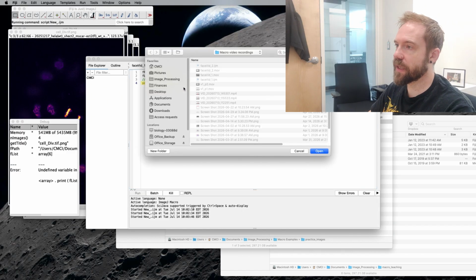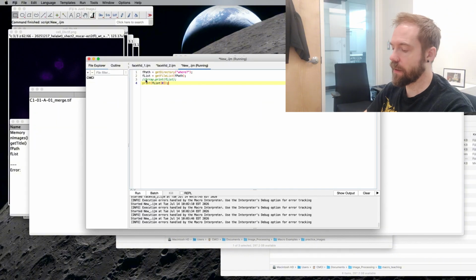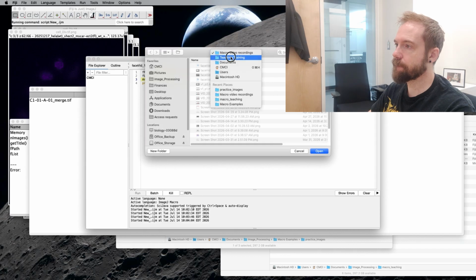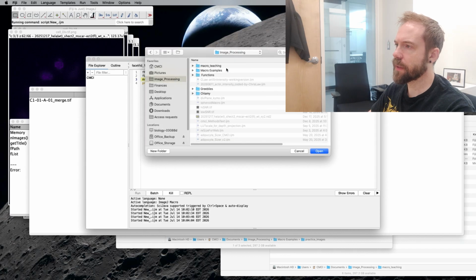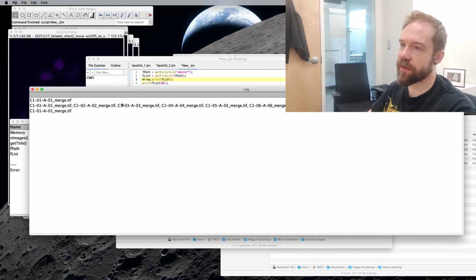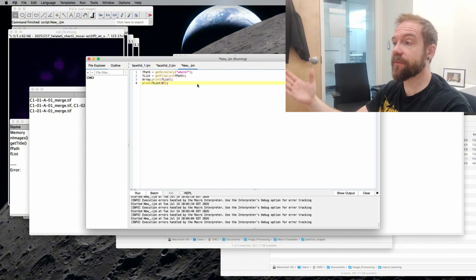So when I run this and select a folder, here we go, this is the folder I want. So I've got a huge list of practice images here, and that's going to just print out the first element of that list. If I uncomment this, so here we go. There's the full list, and there is the first element, or the 0th element, that has been printed. This is really useful because this allows us to open up specific files from a list.